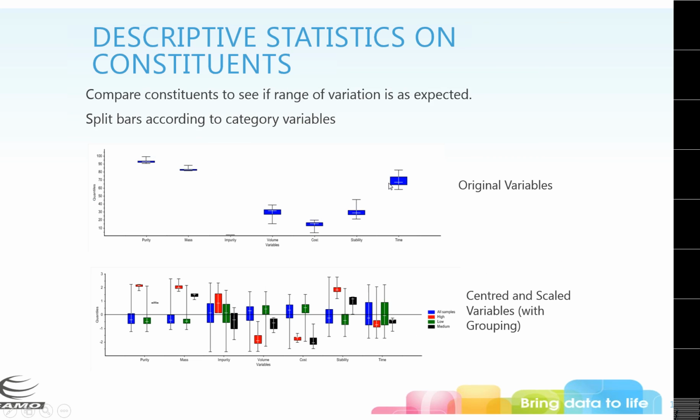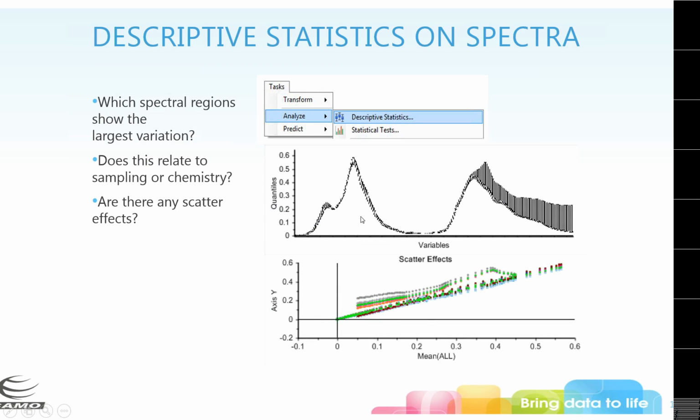This is basically a box plot, a quantiles plot, and so you can see which areas are changing a lot. That's going to show your min, your max, and then your median and your quartiles. You can see in this case that these regions up here are the ones that are varying quite a lot. This is that octane data again. Those are the areas where the samples had some additive in them.